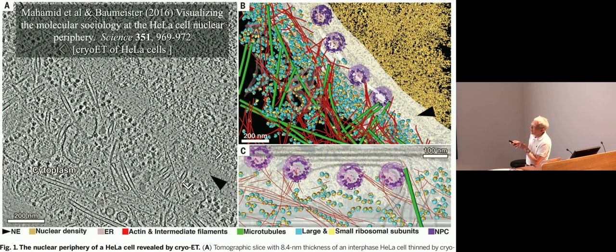and then about 15 years later from Julia Mahamid's work, again in the same group. Julia is now at EMBL, a much better micrograph of HeLa cells, in which you see the actin, now you have tubulin, the ribosomes, you now have individual orientations of them with large and small subunits, nuclear pores and so on. So you'll be hearing about that later on.